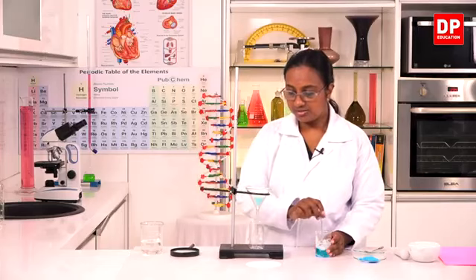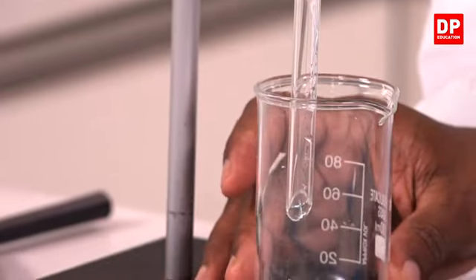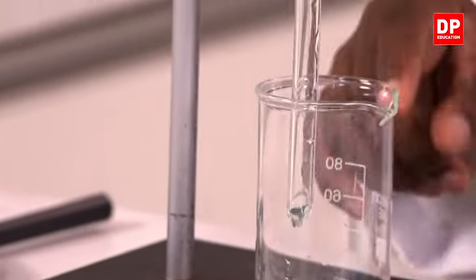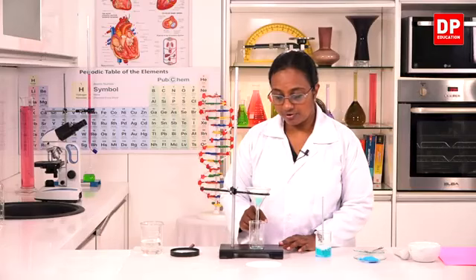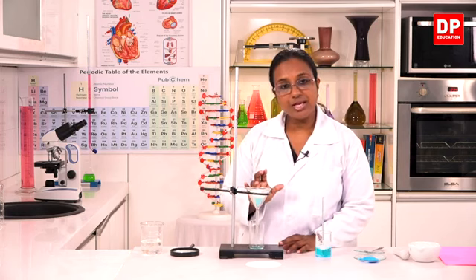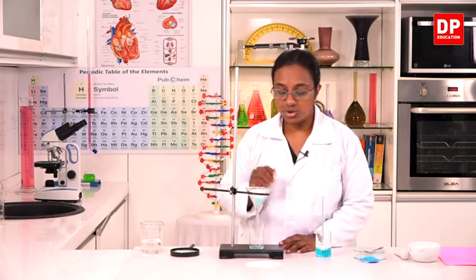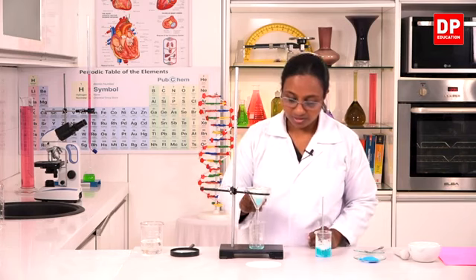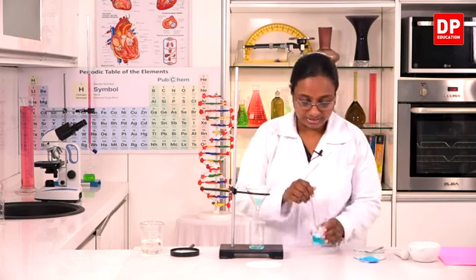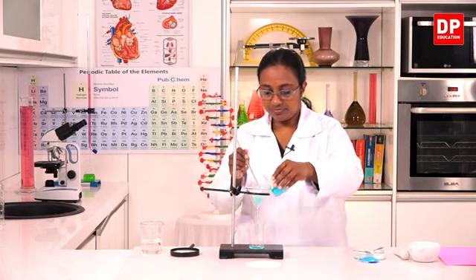You can see, students, this is how we set up to filter substances. A beaker is kept, a funnel is fixed to a stand so that you don't have to hold it, and there is enough space so the solution can flow down. Filter paper is there, that is the full funnel, and we have to make sure that the solution does not go out of the filter paper. It has to be within the filter paper. Here you can see the clear solution flowing down through the funnel and is getting collected in the other beaker. I will transfer.